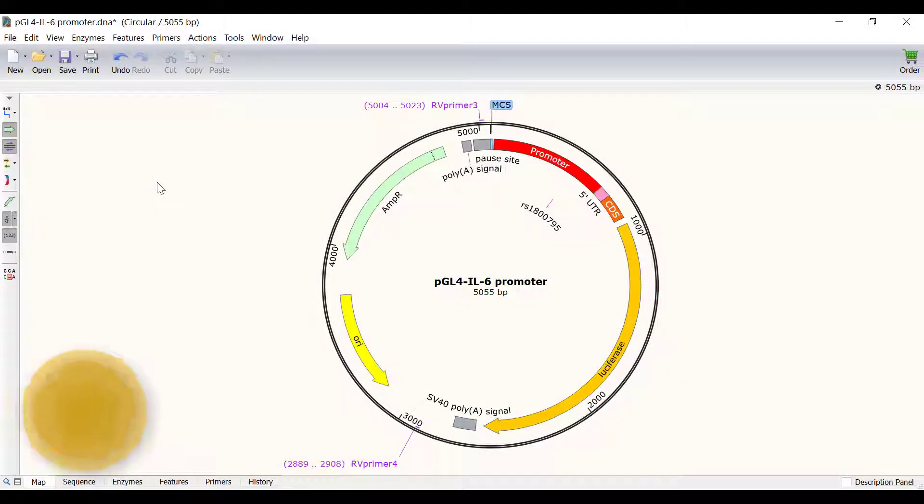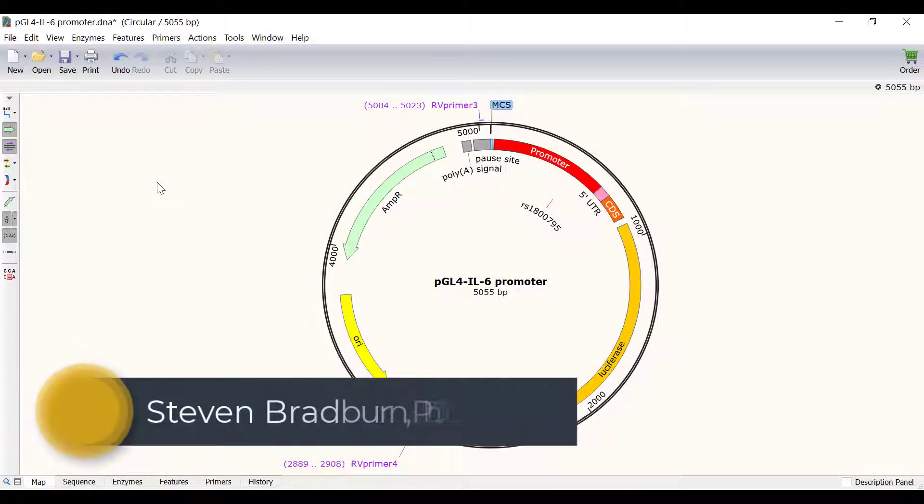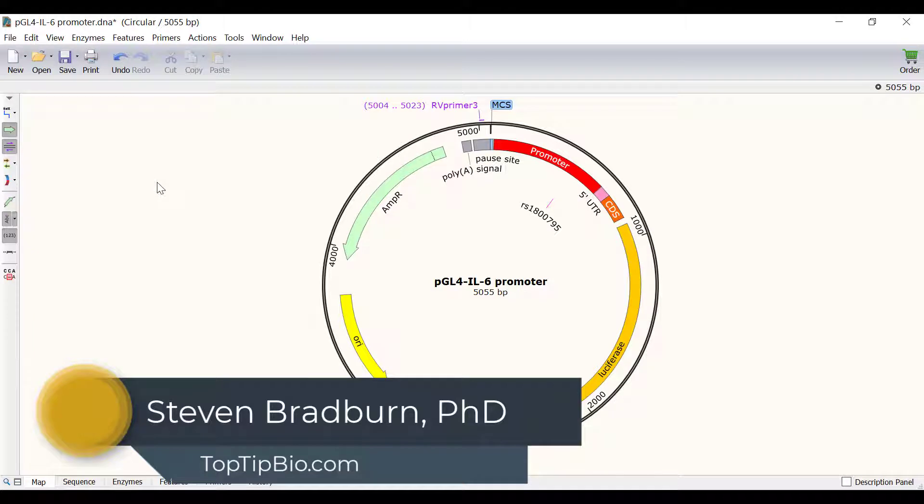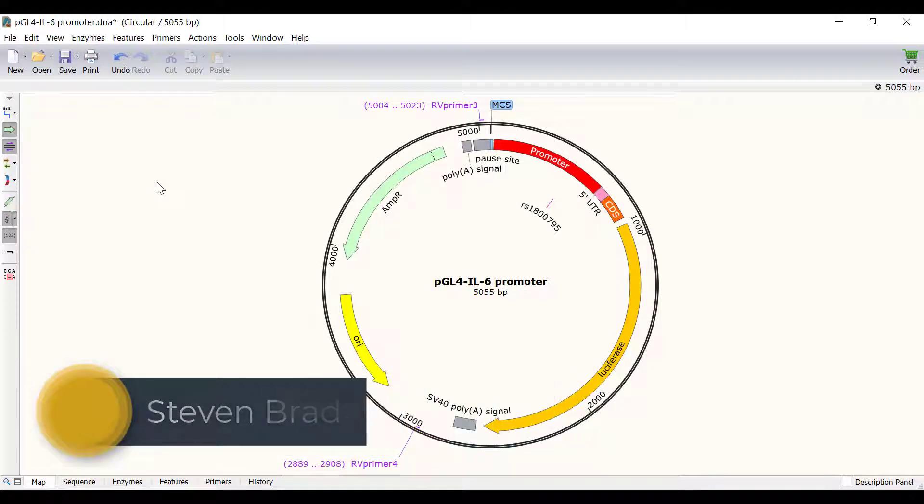In this video, I will show you how you can use SnapGene to create mutagenic primers and simulate a mutagenesis reaction.